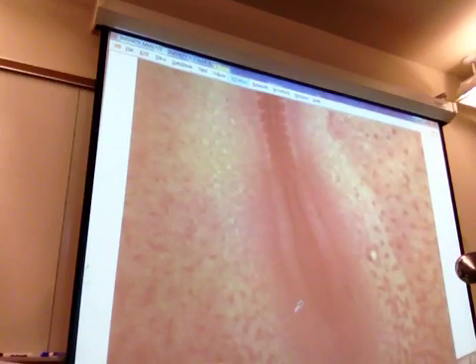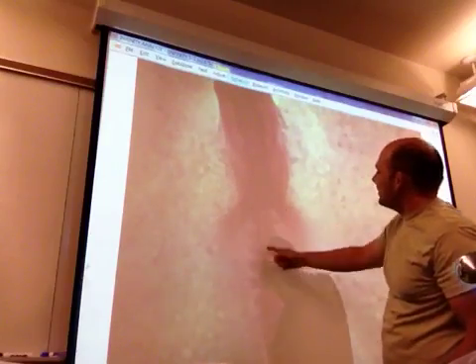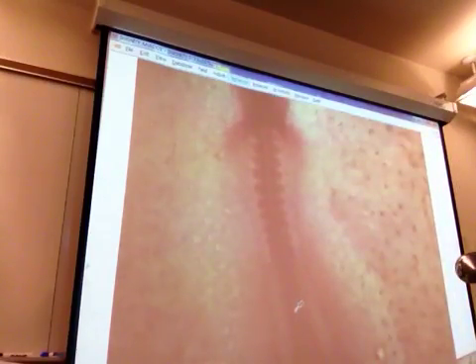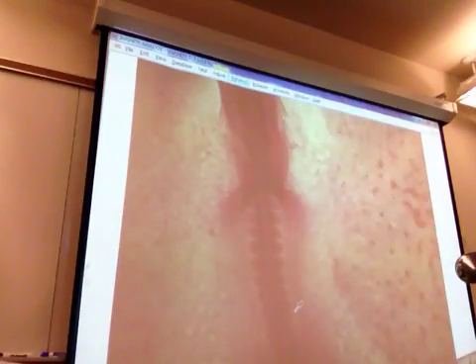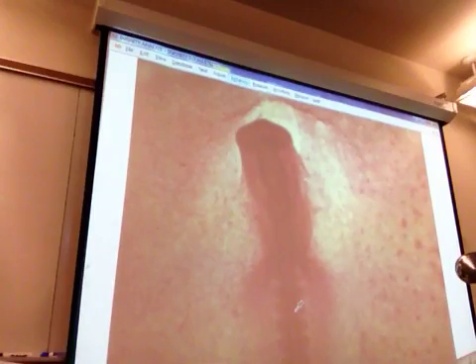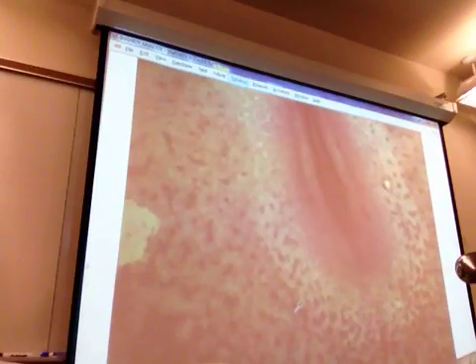And then the notochord is going to form some structures. Would the light part be the notochord, and then the dark part next to the somites be the neural tube? I think what you're seeing with the light part is honestly the gap in the neural tube, because notice it continues all the way up into the primitive brain. So it still hasn't closed, right? It's closed at the top. It's not closed at the bottom.